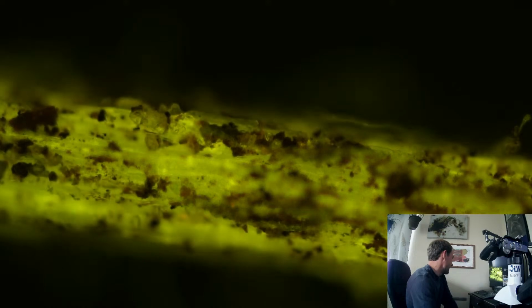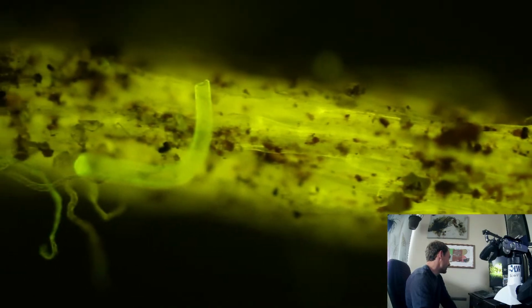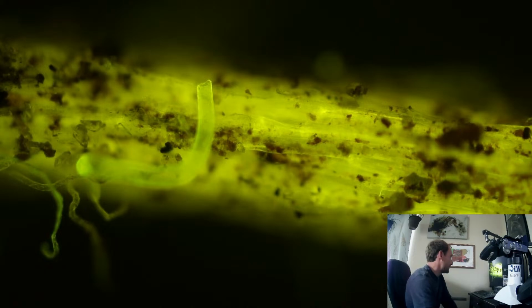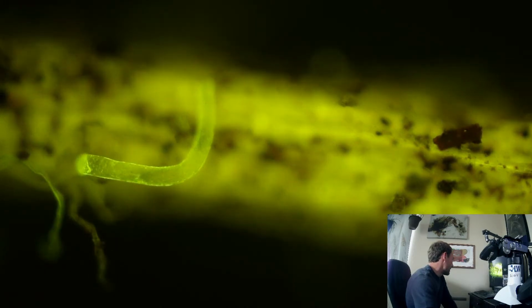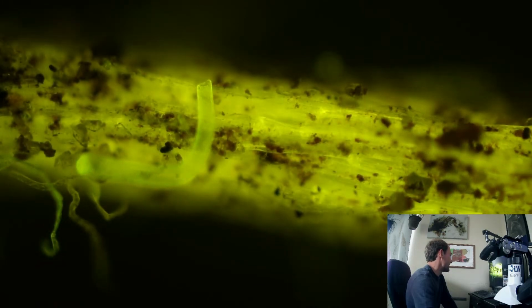It's kind of interesting how all roots look a little bit different. They all glow a little bit differently. Oh, that's a cool looking thing.